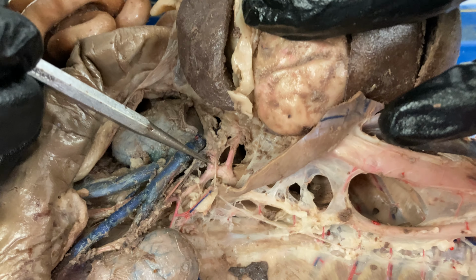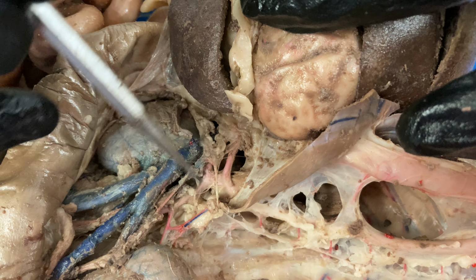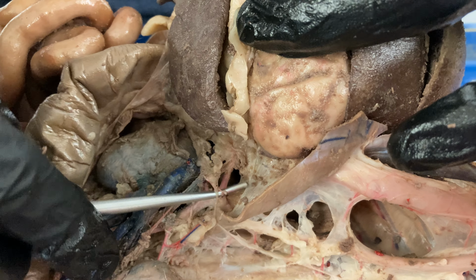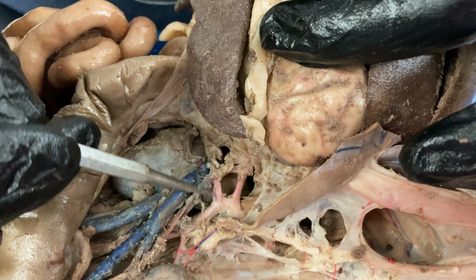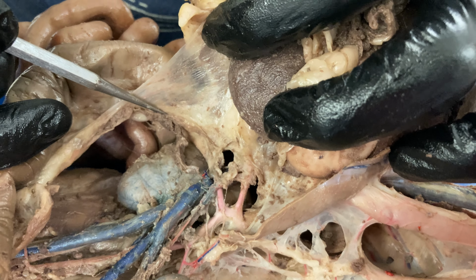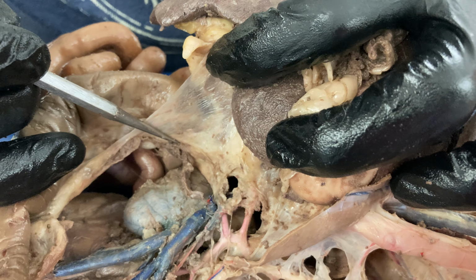Okay. The next branch, which is this one, oops, let me get that out of the way. Sometimes they just don't break quite that easy. The next branch, right there, okay. This would be your superior mesenteric. You see it's a larger branch. This comes, and I'm going to open it up so you can see here is our mesentery of the intestinal system. So it brings the blood supply to the mesentery.